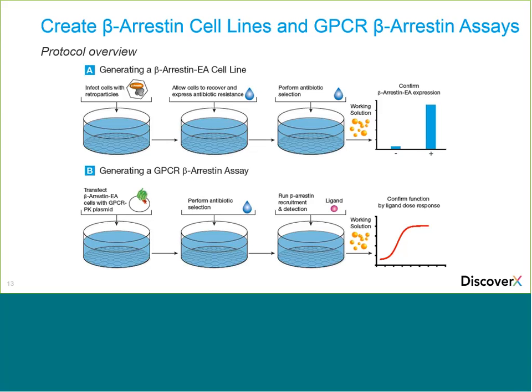Overall, though, both of these assays are complementary to each other. We recommend you do both, looking for different ligand biases, fine-tuning of your ligand pharmacology in general, and the biological pathways.